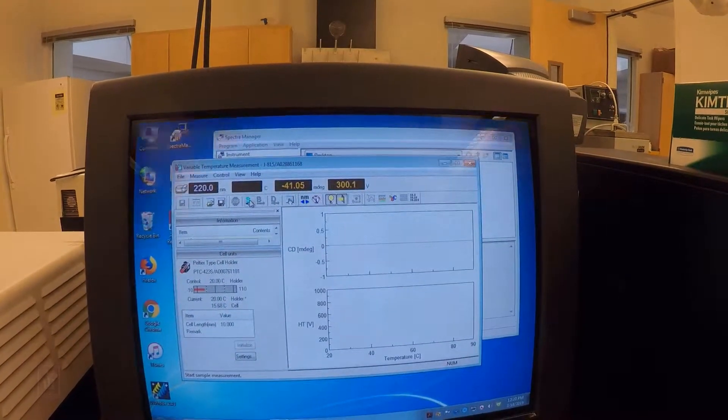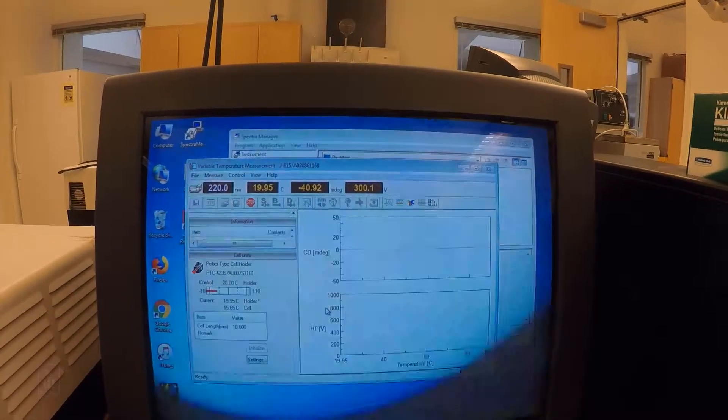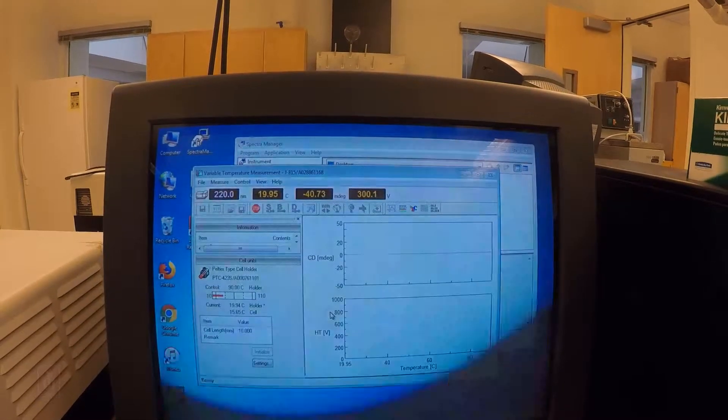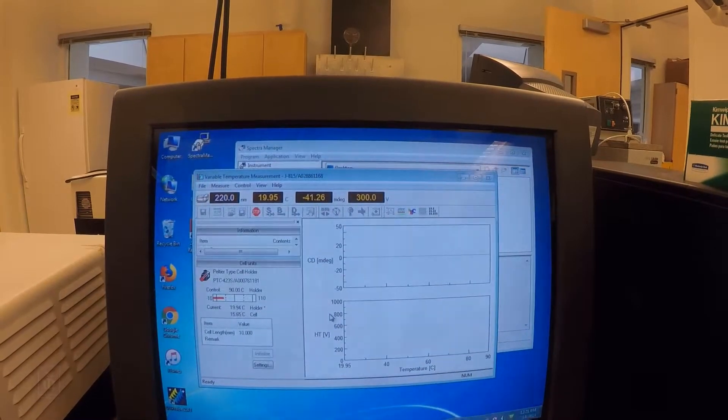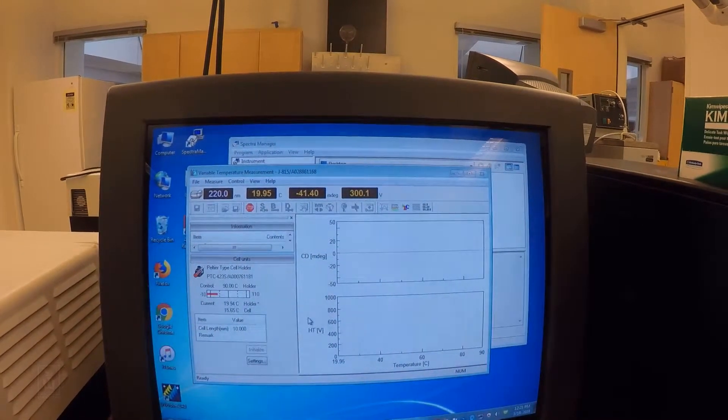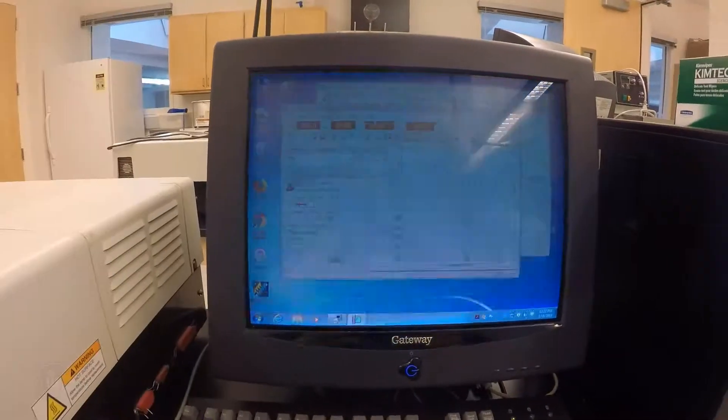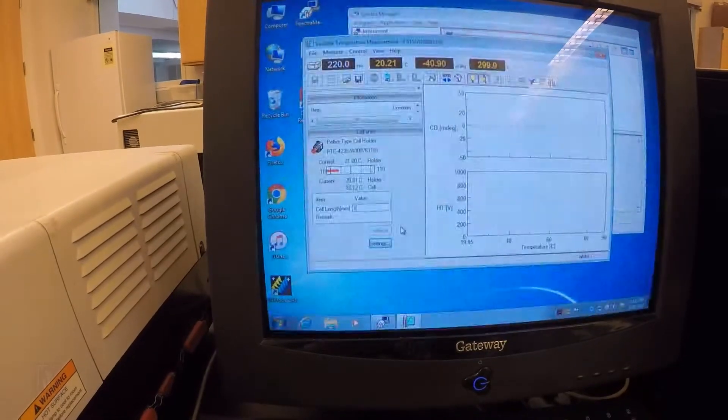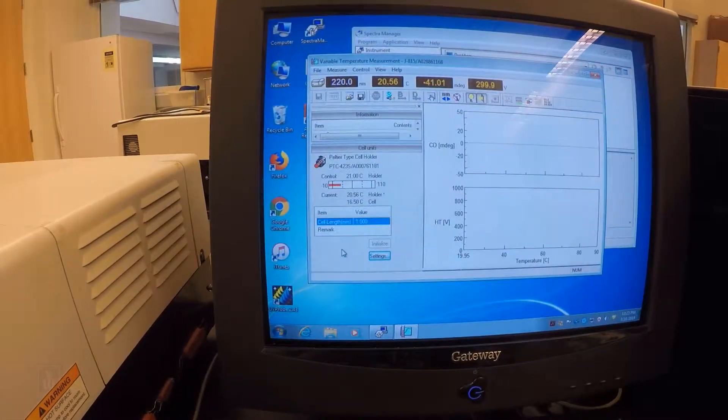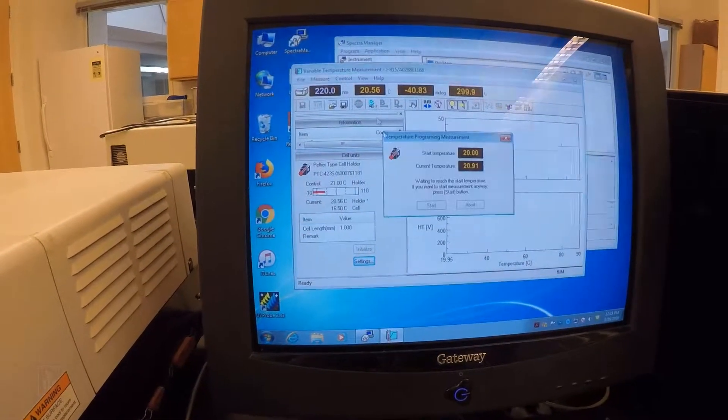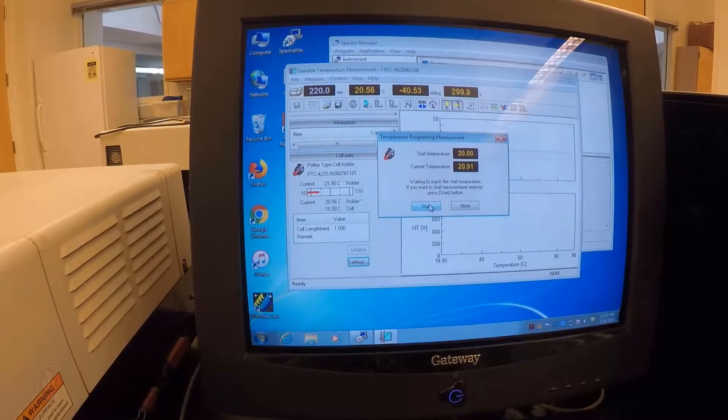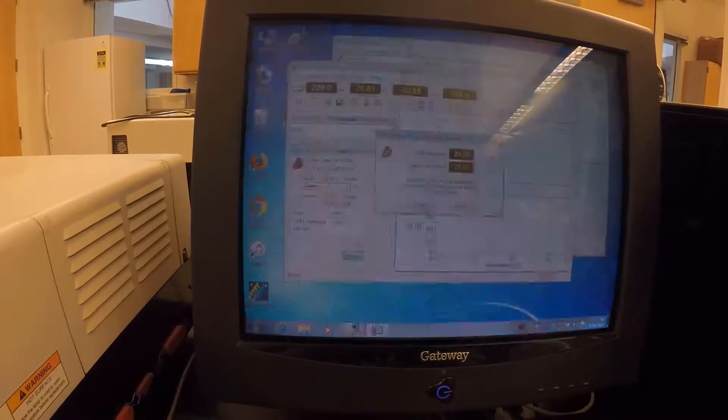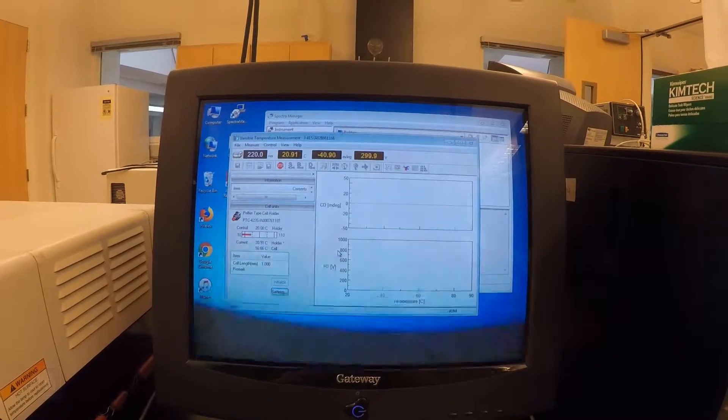Then we want to pick our wavelengths. 220 is appropriate for alpha helices. And pretty much that's all we need to do. So I'm just going to save this as thermal melt. And then I'm going to run my sample and start my sample here. You can just go ahead and hit start if you want if it's close enough to 20 or you can wait for it to equilibrate. One last thing I didn't talk about is we need to set our cell length. We have a one millimeter cuvette that's going to affect our reading. So once you've got that changed in there, then we can hit start and start the acquisition.